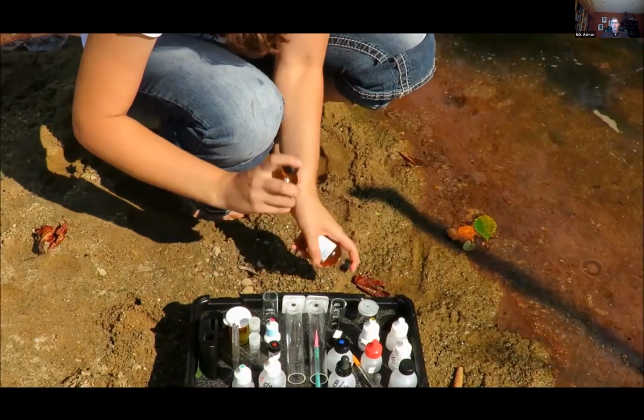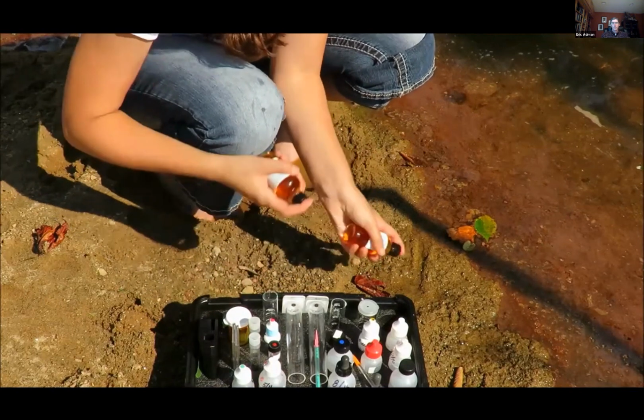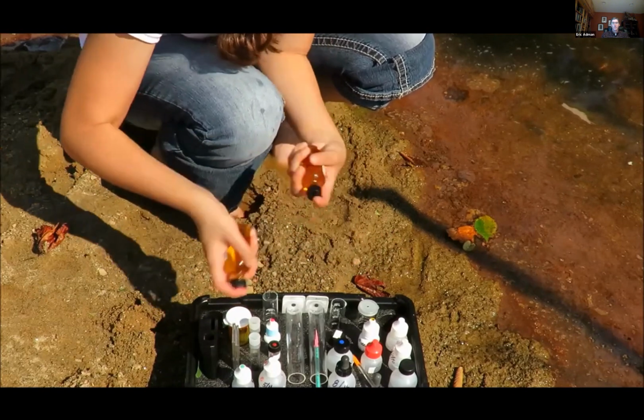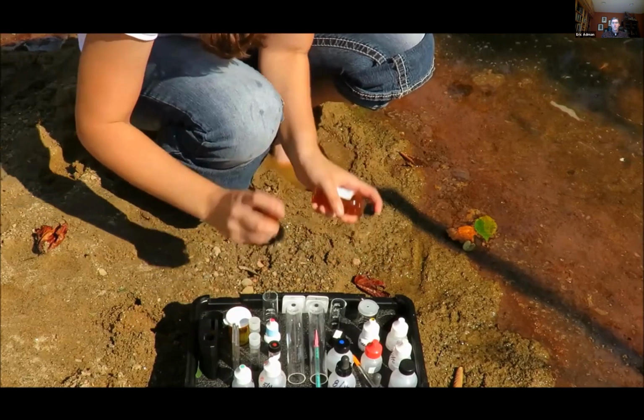Be patient during this step. Brown flecks in DO bottles may take several minutes to dissolve, especially in cold water. It may be helpful to begin sampling your site with the dissolved oxygen test so that other tests may be performed while waiting for DO reactions to complete.